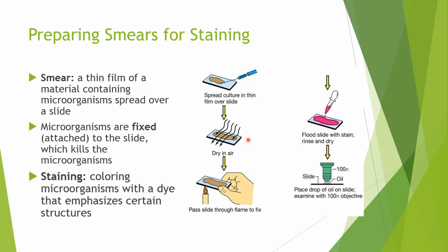Even if they're not coming from fluid, we usually add a drop of water, and again, we'll explain all of those techniques, but it's extremely important that you first leave it to air dry completely. So this process, do not rush it. You leave your slide on your desktop, on your workbench, and you leave it until it air dries.